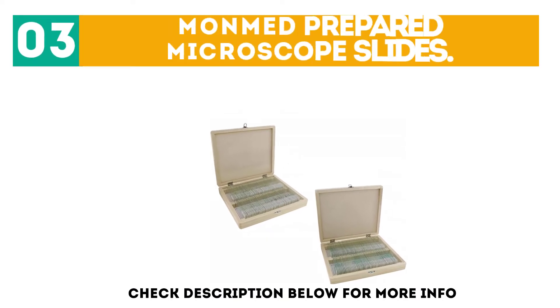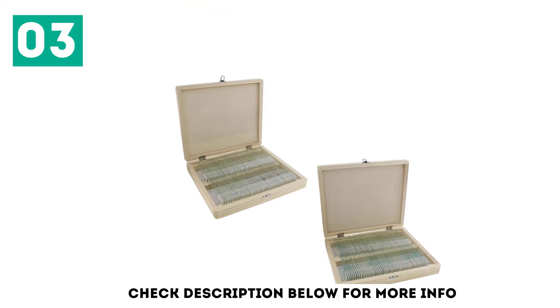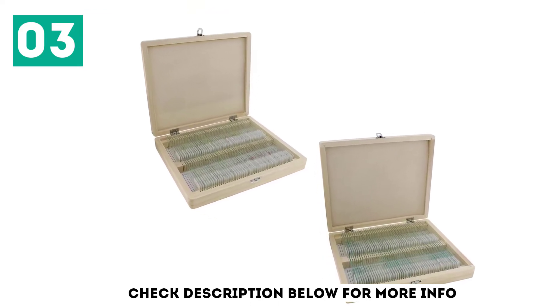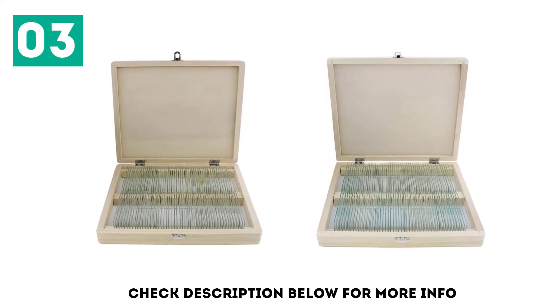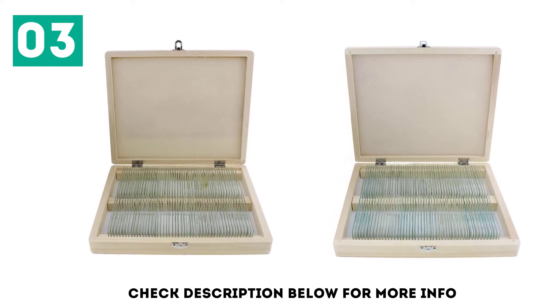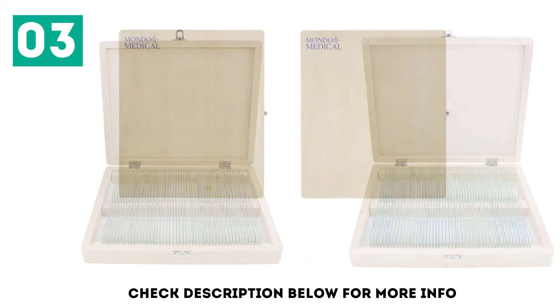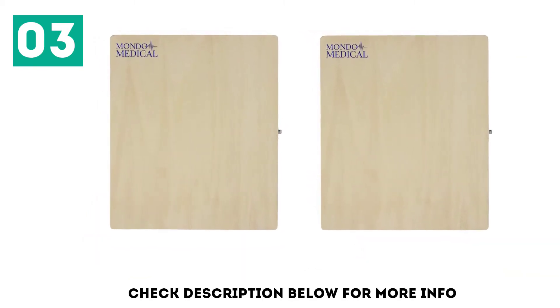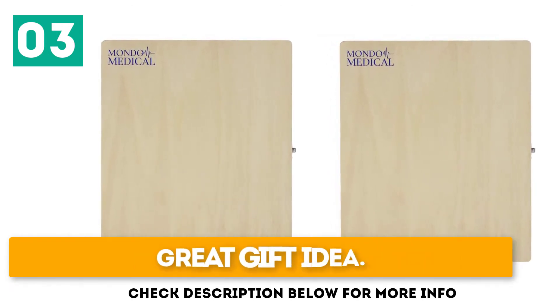At number 3: Mone Med Prepared Microscope Slides. This set features 200 unique specimen microscope samples on clear glass slides, for use with educational and professional grade microscopes to improve learning and exploration. The Mone Med comes with a wooden box for organization and makes a great gift to encourage scientific exploration. Key features: built to last, convenient storage, and great gift idea.